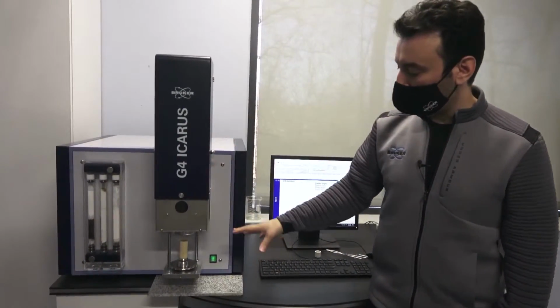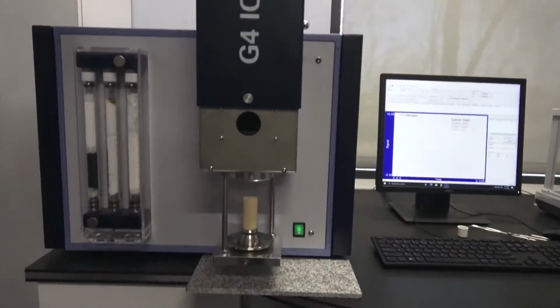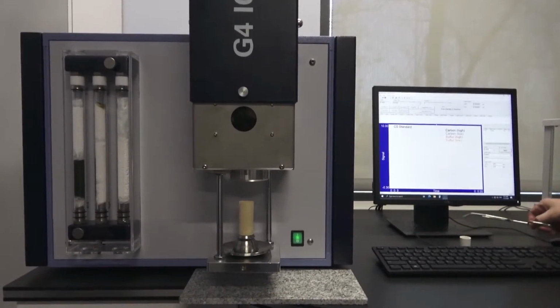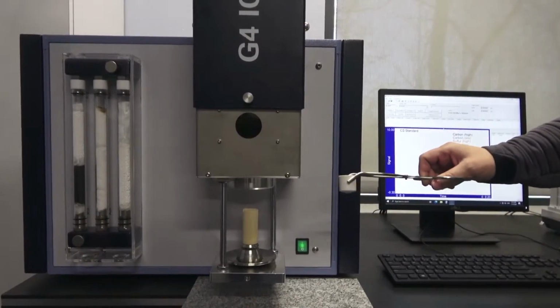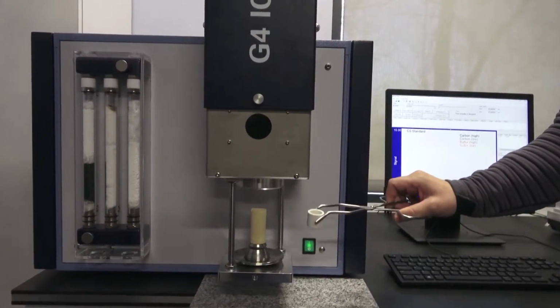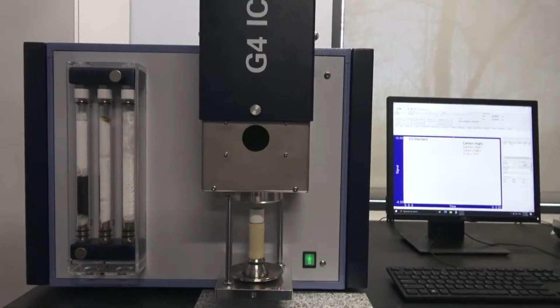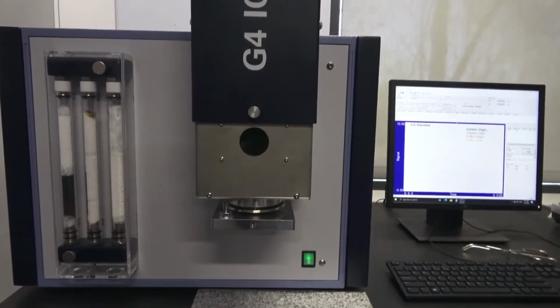I'm going to open the furnace now. This is the crucible carrier that we have. So if you want, you can go ahead and analyze the sample. Yeah, that's great. Let's talk about the analysis. So it looks like you've kind of preloaded this. You've weighed it out. Yeah, in this ceramic crucible, we already have the sample, and on top of the sample, we have the tungsten accelerator. So yeah, I put it on the crucible carrier, and I start the analysis.